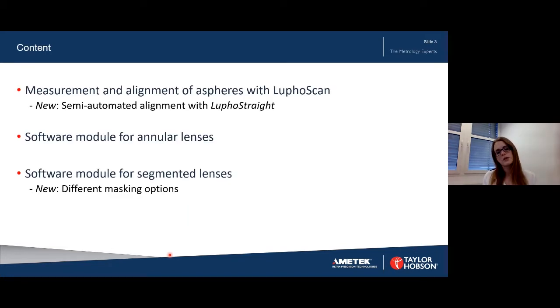So what's the content of the seminar? Maybe some of you have already watched a seminar 4 weeks ago from my colleague, Dr. Mark Wendel. He explained the basic principle of our LuphoScan measurement device, showed you what the instrument is capable of, what measurements we can do. And now, starting with this webinar, we will have a series of webinars giving you more detailed information about the special measurements you can do on software modules.